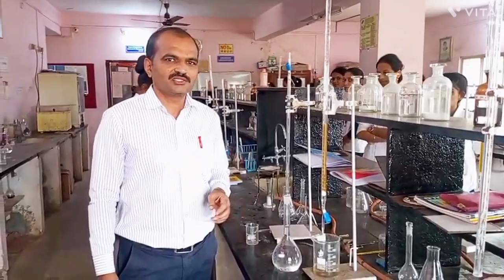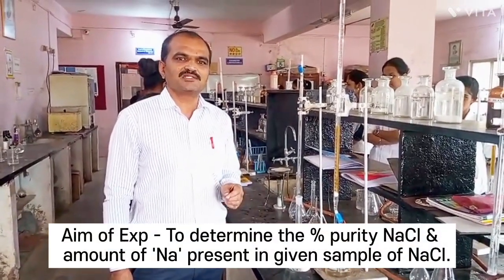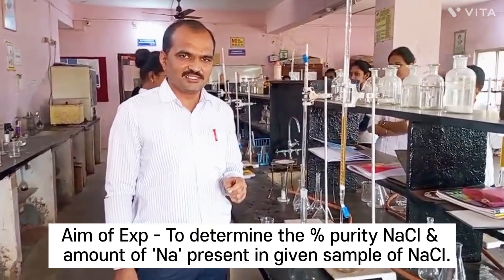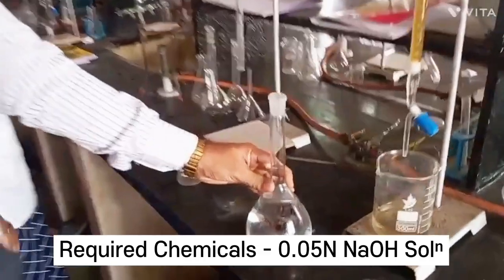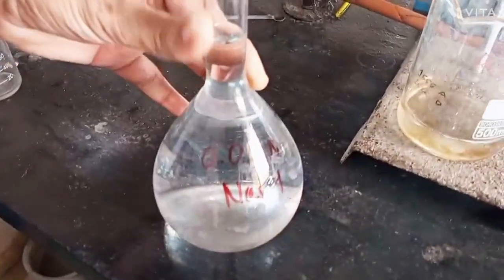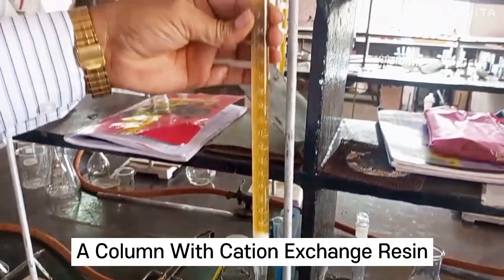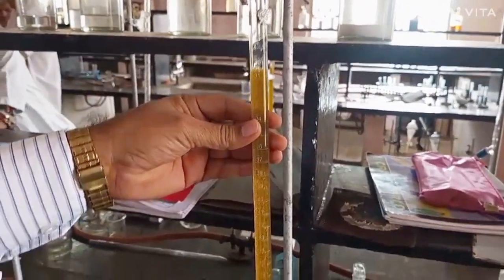Hello students, today we are going to do the experiment in which we are going to determine the percentage purity of NaCl and the amount of sodium present in the given sample of NaCl. The experiment requires 0.05 normal NaOH and a column containing a cation exchange resin charged with H+ ions.